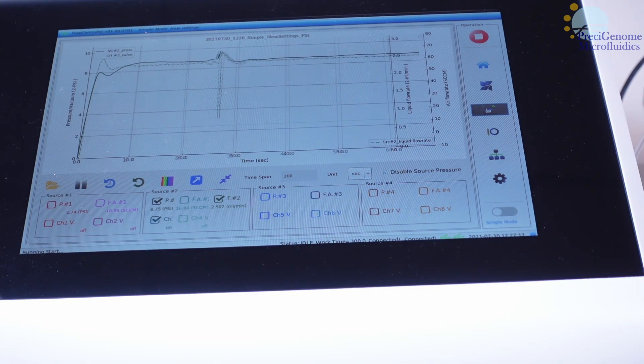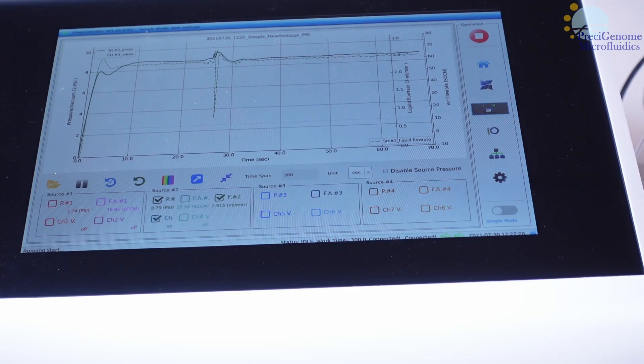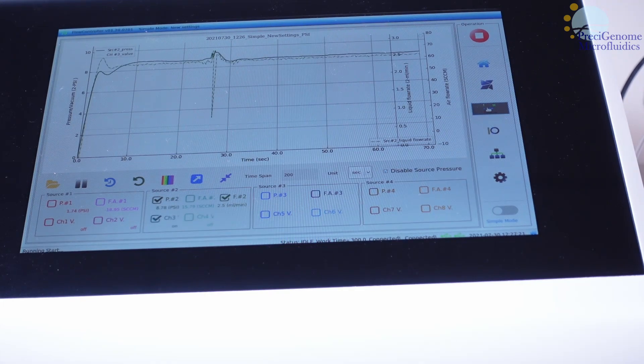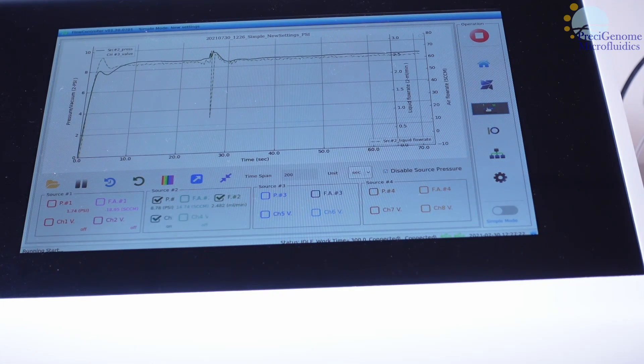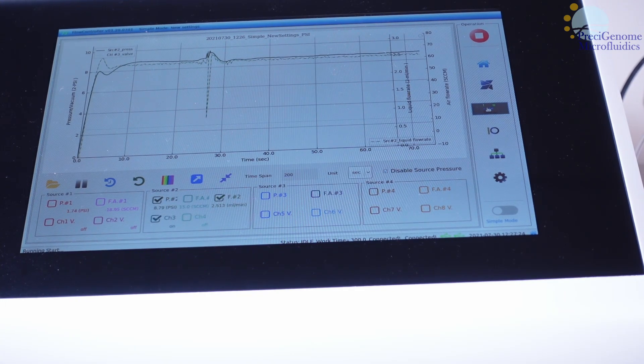When you have enough data, use regression analysis in a spreadsheet program to find a best fit line for your true flow rate.